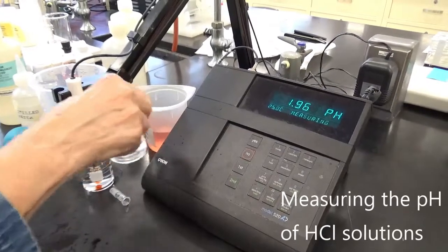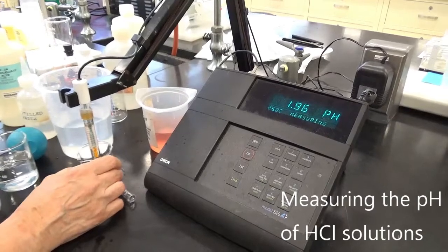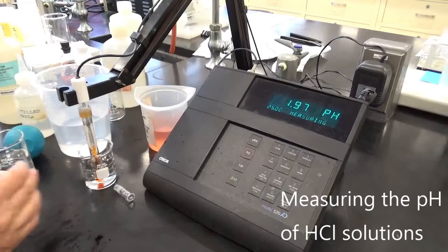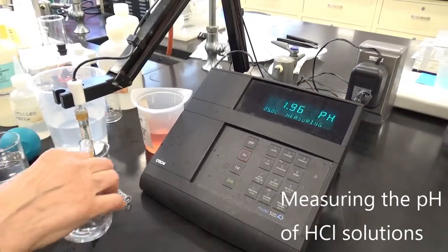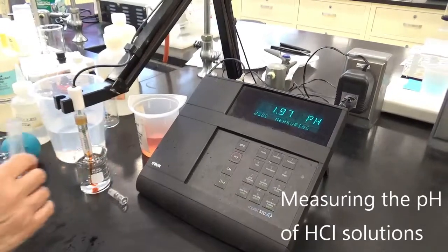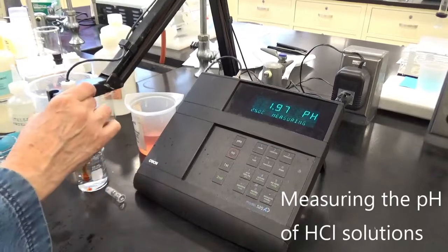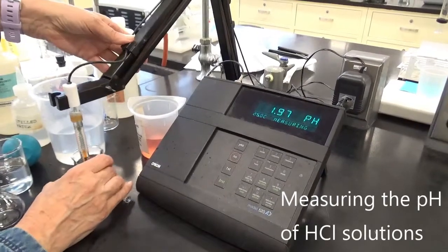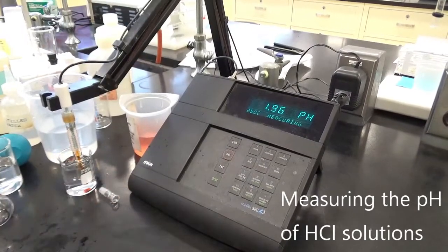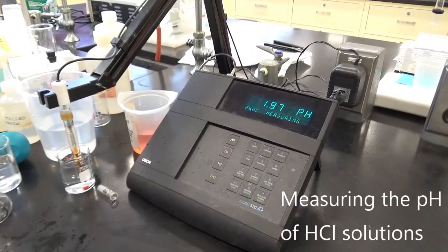Get this out of the way. I think it actually needs a little more. That's the right one, right? I'm just going to pour it all in here. Make sure it's high enough. Okay. Let's let it settle. Sometimes with this pH meter, it should give a beep.